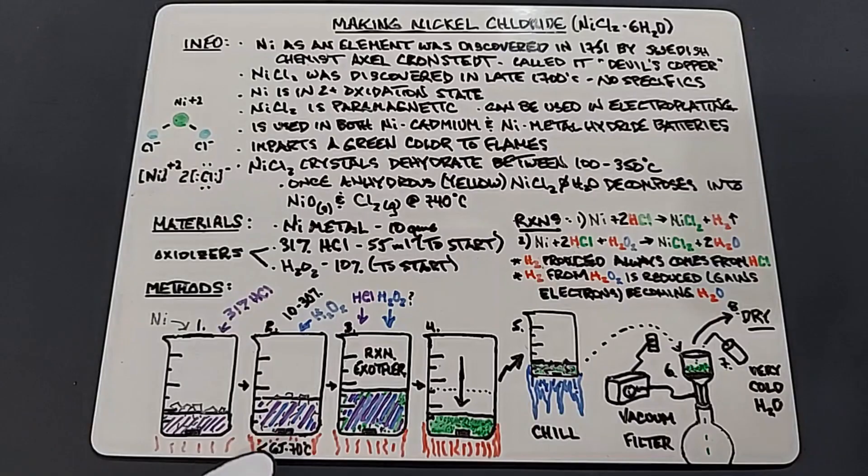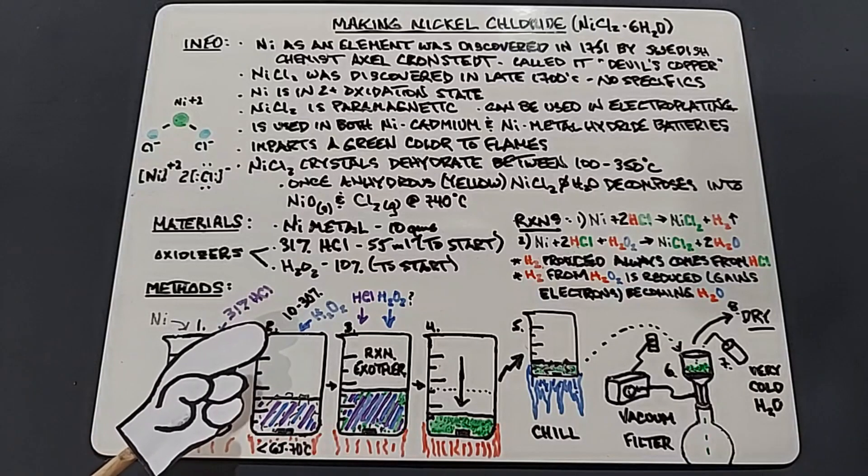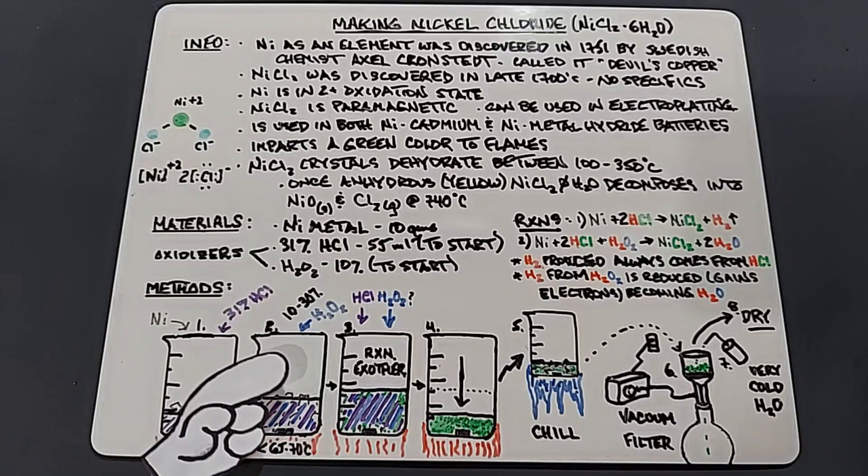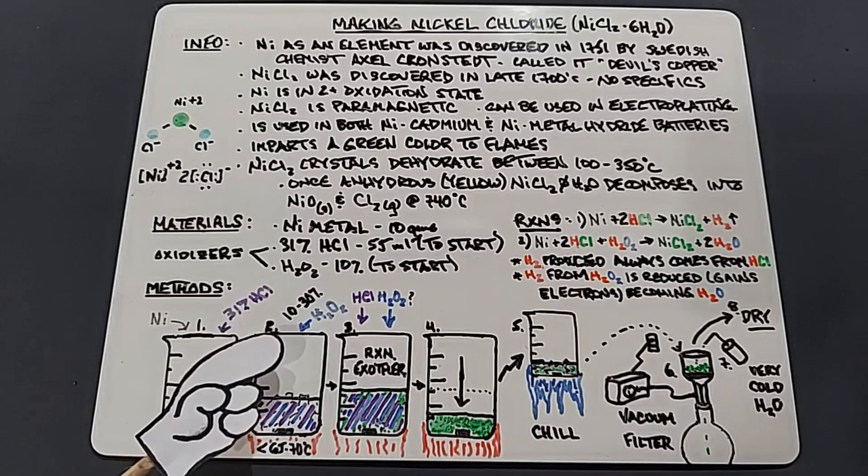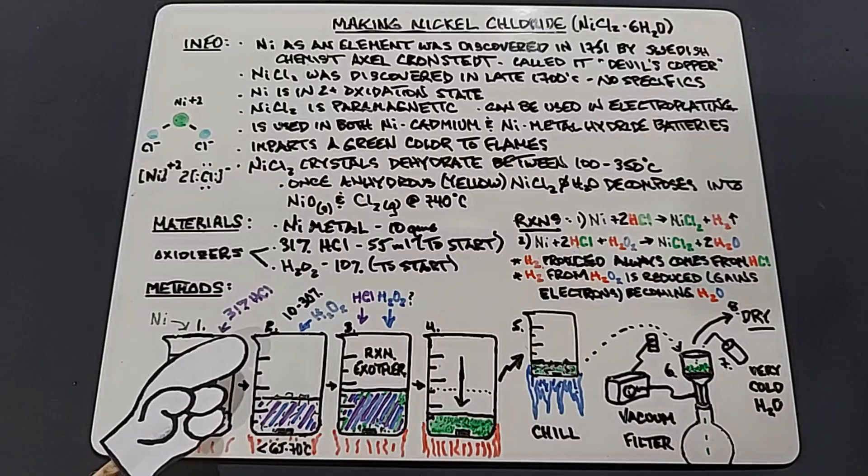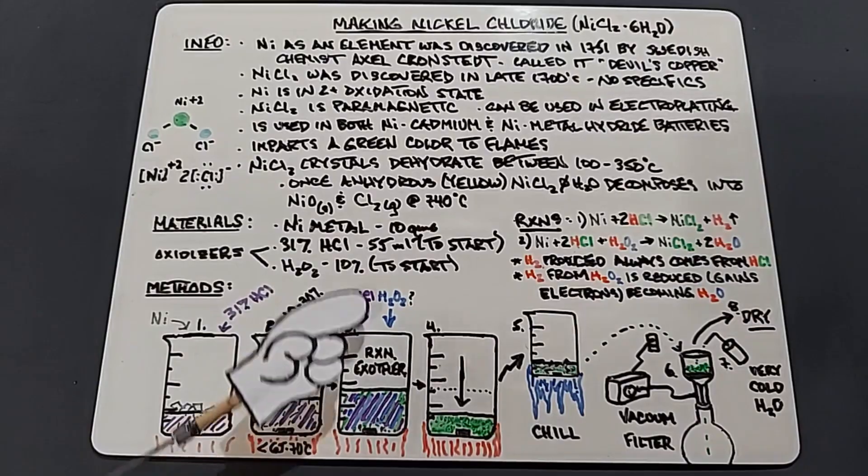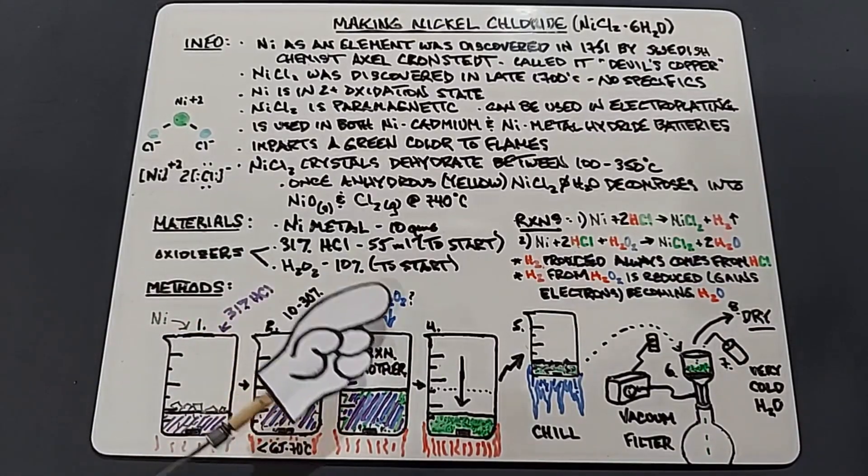It will be under heat the whole time. I don't like to go above 70 degrees Celsius when using hydrogen peroxide because it will start to break down. You can go up maybe to 80 degrees, but I've done experiments in the past where I broke the hydrogen peroxide down so badly that at the end it didn't really do something because it just entered this solution and broke down.